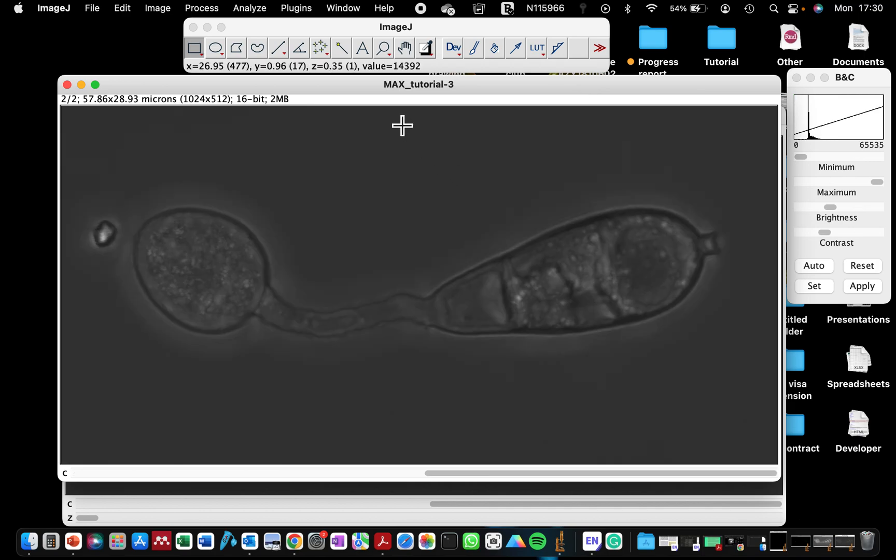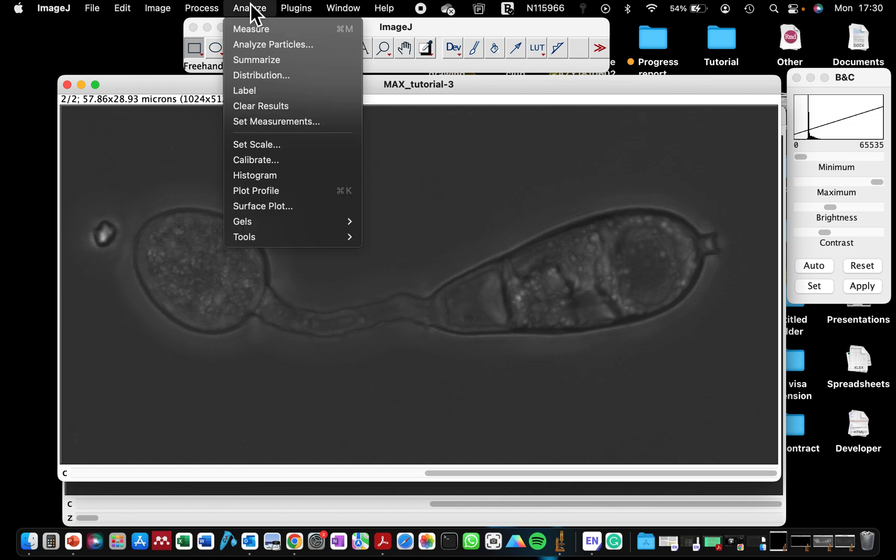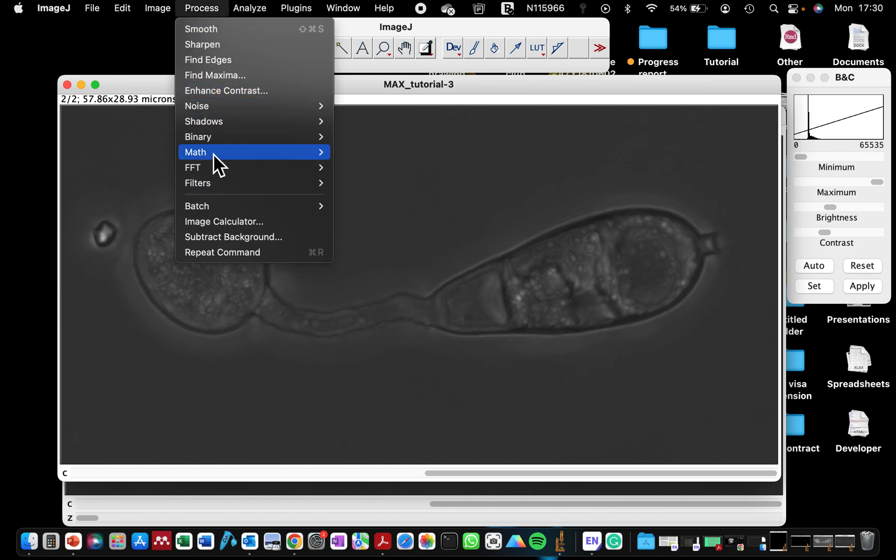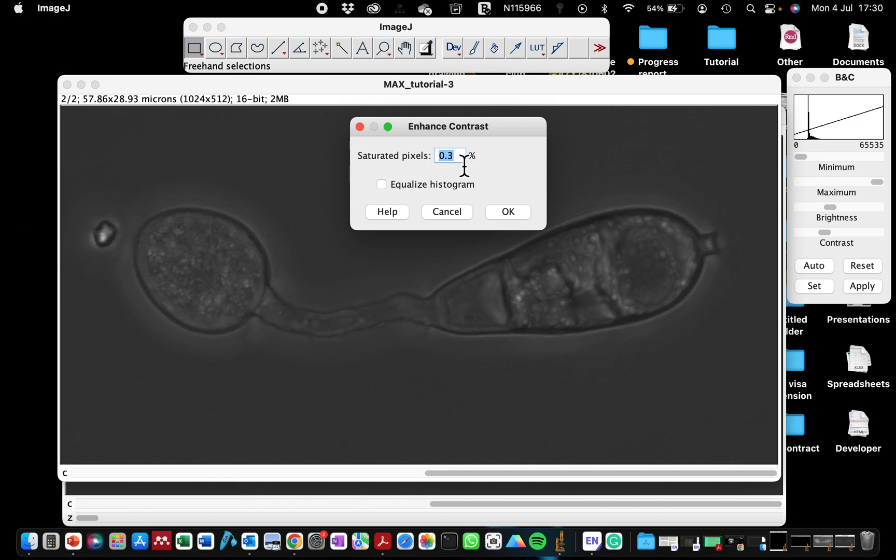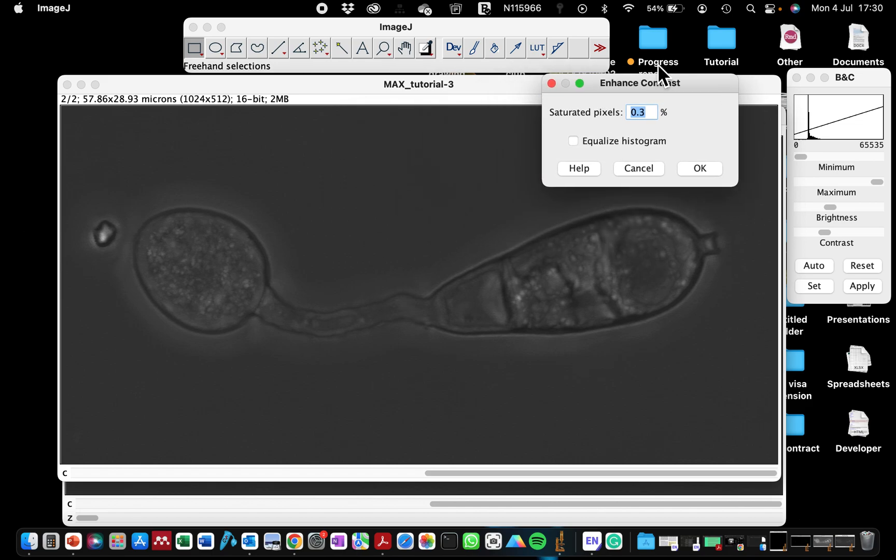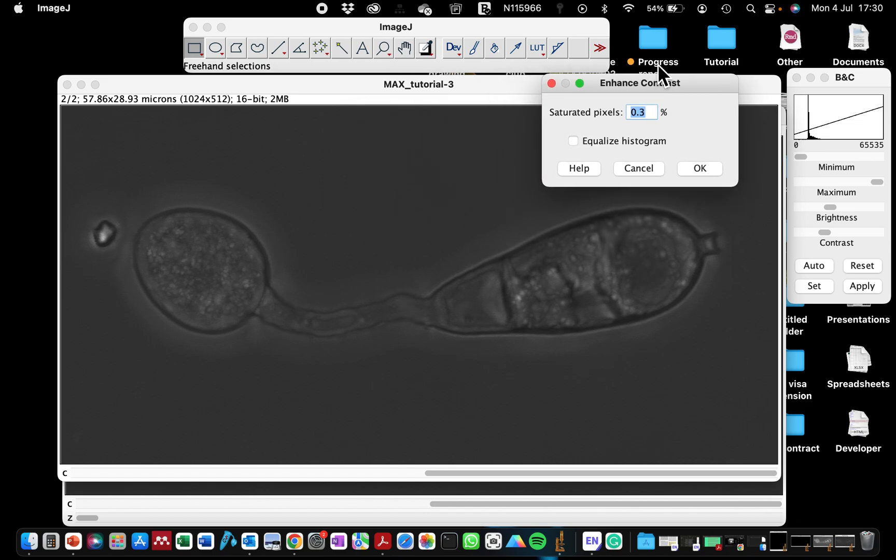So those are the two different ways to enhance your images. So if I'm going to do this also, I'm just going to go back to Process Enhanced Contrast 0.3. Normally by default, whatever value ImageJ recommends for you is usually sufficient.